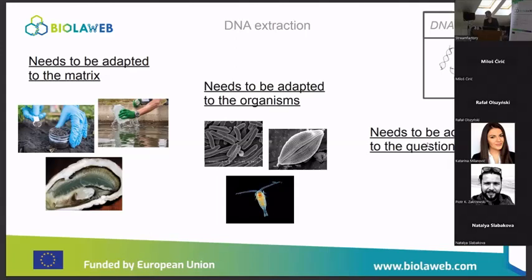So you have 2 options for DNA extraction. It's either using organic solvents for the extraction, which is called the phenol chloroform protocol, or you can use commercial kits that present the advantage that they can be already optimized for different matrices of samples.